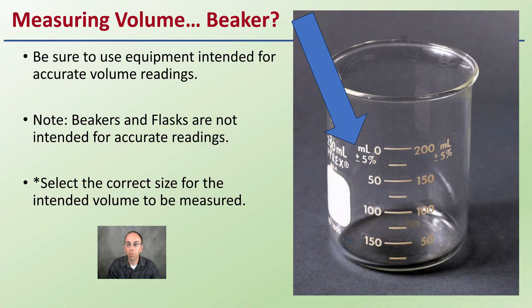Let's get into measuring volume. A lot of people go grab a beaker, but I strongly advise against this because if you look at the beaker itself, it tells you it's an approximate volume. It tells you these volume markings are plus or minus 5%, not really highly accurate. So avoid using this equipment — beakers and flasks are not used for accurate volume readings.